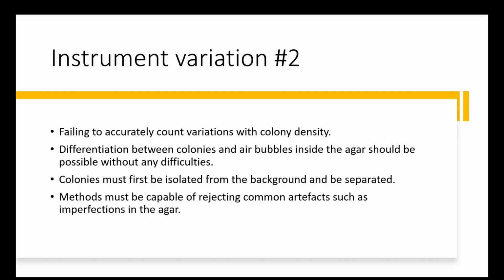It also stands that counting procedures can also lead to deformities in the agar as well. Artifacts like imperfections in the agar, dust, a lack of clarity, particularly with certain media where we might need to add an additional ingredient during the preparation process. If we sterilize the media at a lower temperature, sometimes they can lead to swirl-like patterns within the media itself, which can then cause issues.